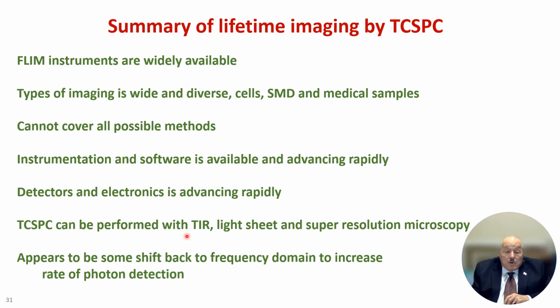Software is available. Detectors are advancing rapidly, and it can be performed with other methods which we haven't discussed, such as total internal reflection, which gives you the equivalent of only seeing the molecules that are very close to the slide, or light sheet and super resolution methods. FLIM can be done with any of these.